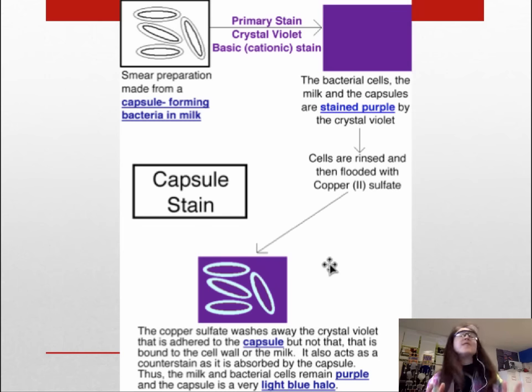So today you are going to finish the staining on your unknown. You're going to do an endospore stain. You've done a gram stain. You've done an acid-fast stain. You did a basic stain. You're going to finish off that unknown, and in lab you're going to write your unknown press release. So that should be a lot of wicked cool fun.